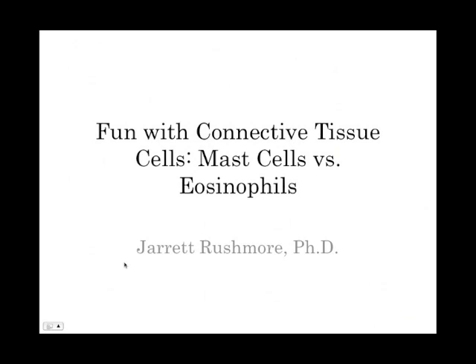Well, hello, I'm Dr. Rushmore, and I'm happy to welcome you to a video that I'm calling Fun with Connective Tissue Cells, Mast Cells versus Eosinophils. Now, over the next couple of weeks, you're going to be taking a gander at the different types of cells that live in connective tissue, and you'll be asked to identify them on the basis of their morphology. For most of the cells, it's fairly straightforward, but for these two cells, for the mast cells and for the eosinophils, it's a bit trickier. And so the goal of this video is to help you suss out that difference.